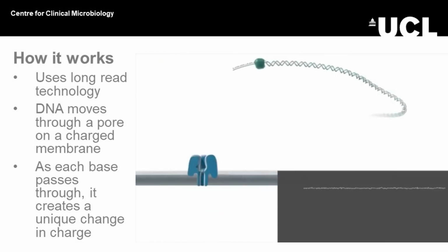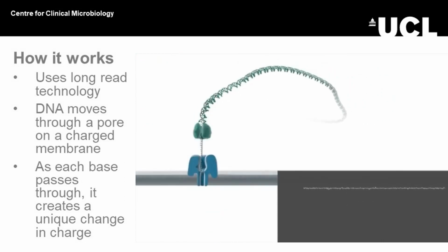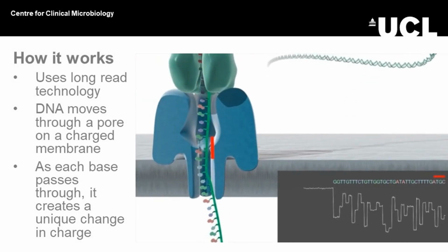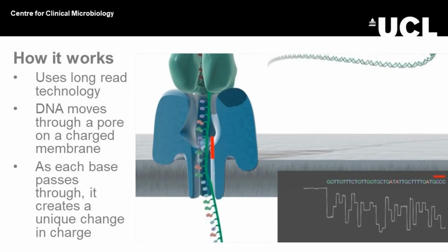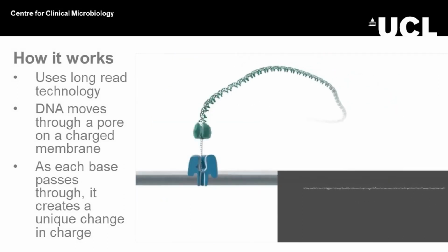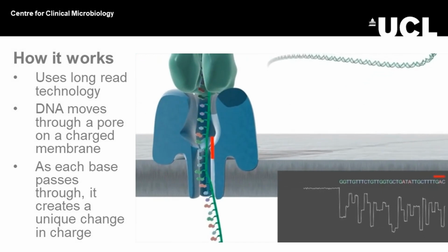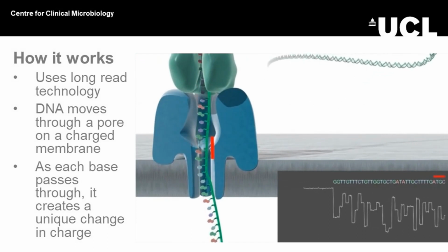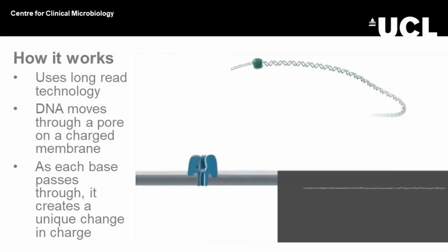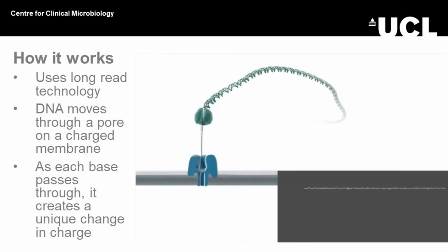And you can see these pictures that Nanopore have got. They've sequenced in space. They can sequence in the jungle in high humidity. They've sequenced in Antarctica using a mug of coffee to warm up some of the reagents. They've sequenced in the desert. The idea very much for Nanopore is sequencing anywhere by anyone and anything. So hopefully this fits our remit.